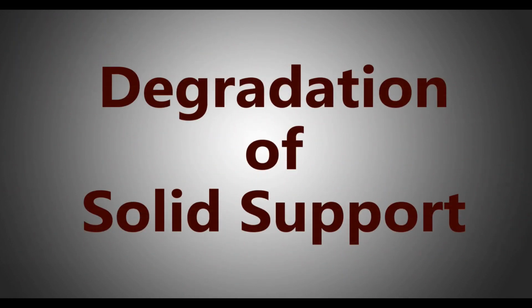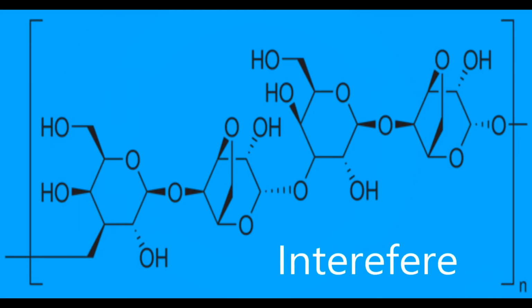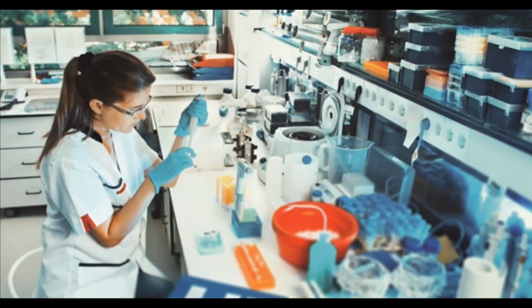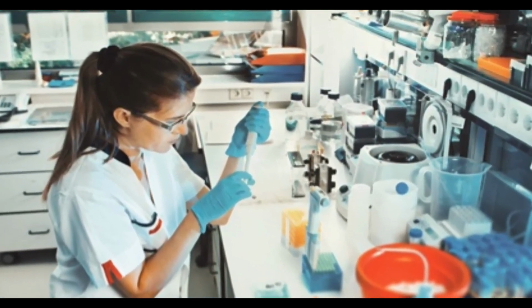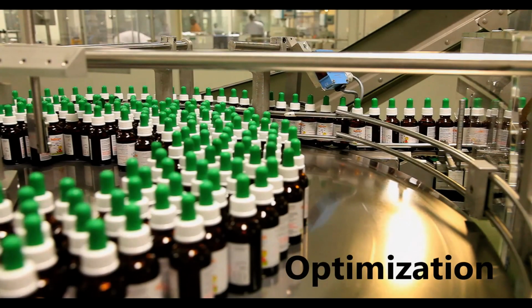Seventh, degradation of the solid support. Eighth, expensive ligands. Ninth, interference with structure. Tenth, limited sample volume. Eleventh, for using it, the person must have skills to handle it. And twelfth, considerable optimization is required.